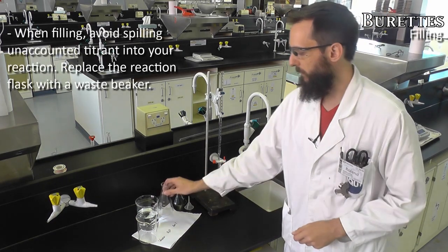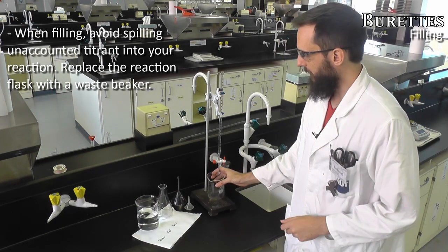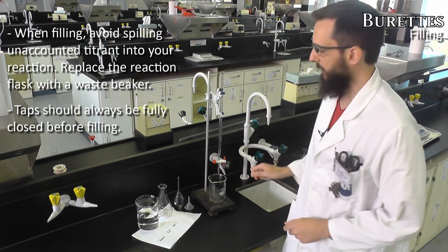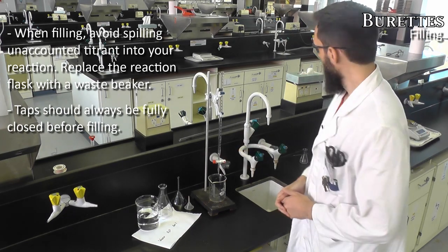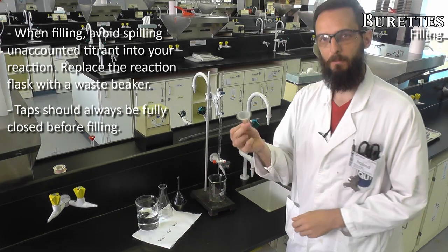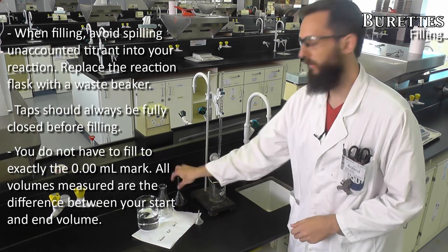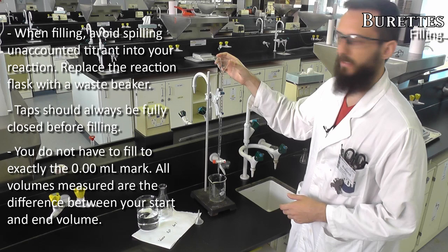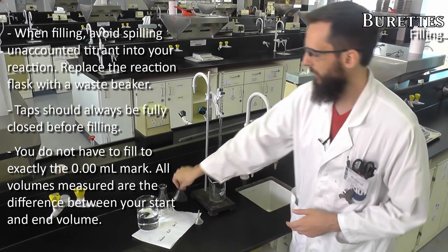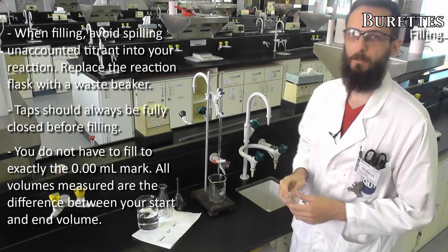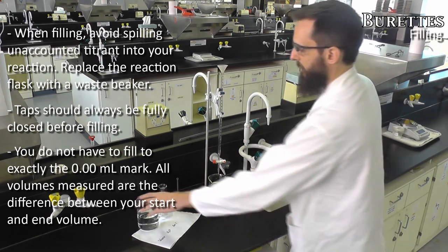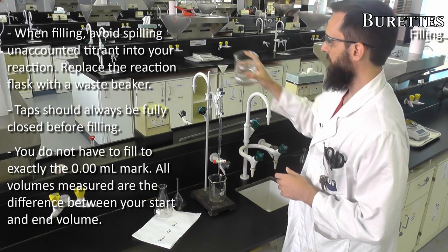When we want to fill our burette it's important to first take away any reaction underneath just in case we have any spills. So I'll remove that and put a waste beaker in there instead. The next thing I need to check is that my valve is closed. Then we will use a small plastic funnel. If I was to use the glass funnel you'll see that putting that in it's quite a snug fit. It rattles a little bit but not much, and when you start filling towards the top you'll very easily get spills. So I'd recommend using these smaller funnels. Stick that into the top and then you can begin to fill.